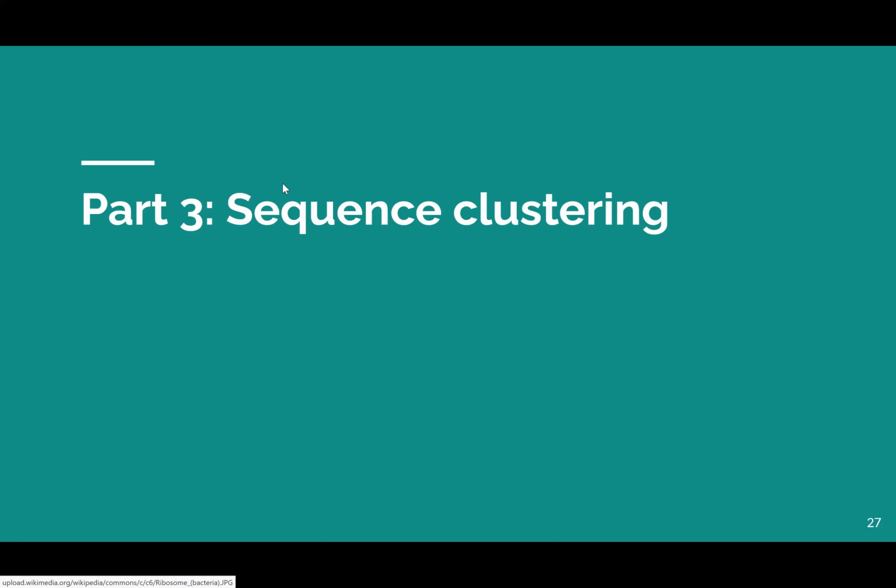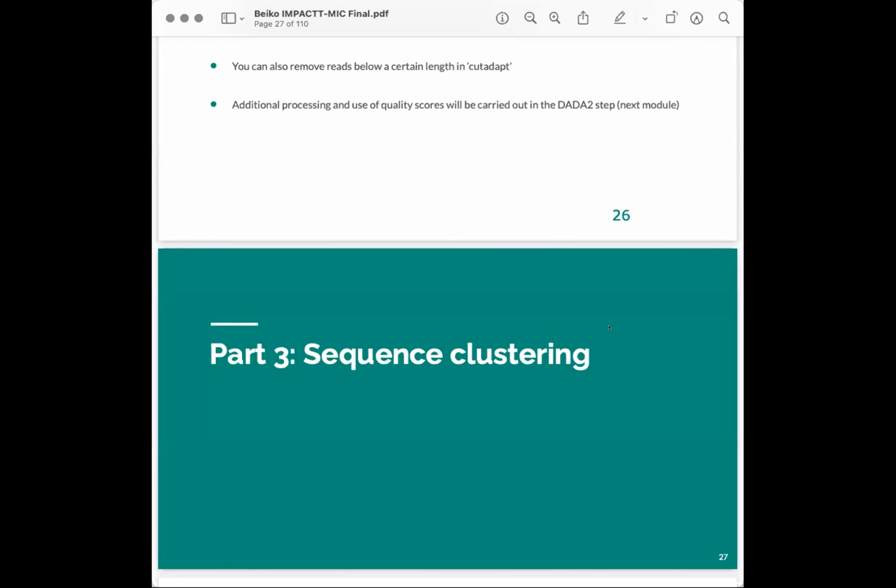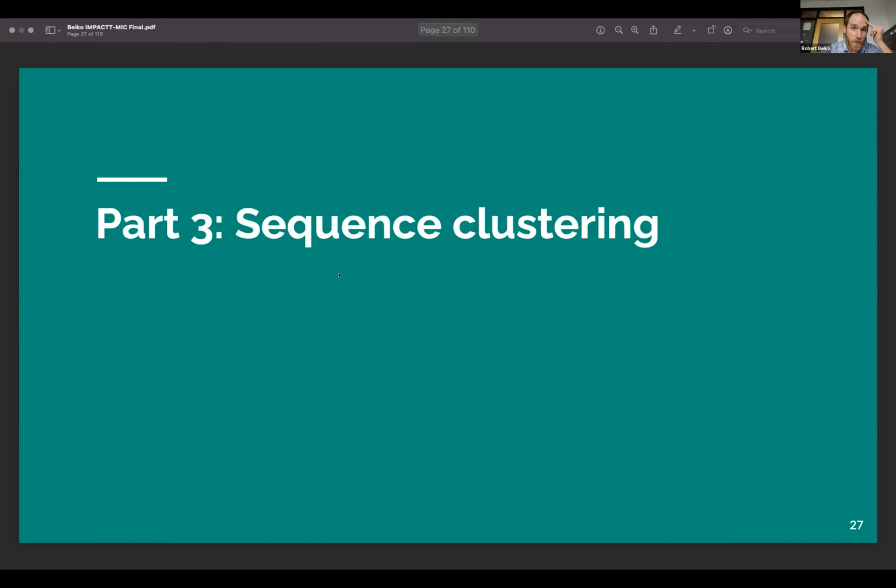She said, is there a difference in sequence quality between your R1 and R2? Well, Diana, you've stared at this a lot. I think in general the reverse read tends to have lower quality than the forward. And actually, I think your most recent results really do bear that out. I think those are on your poster too, right, for the conference? Yep. So generally the forward read has a higher quality than the reverse read.